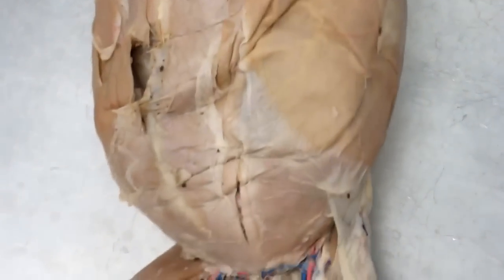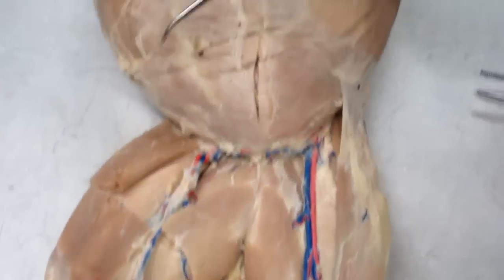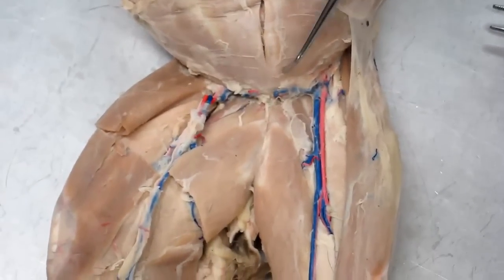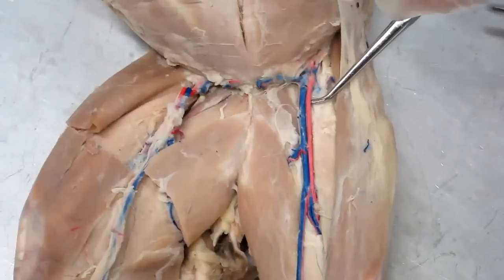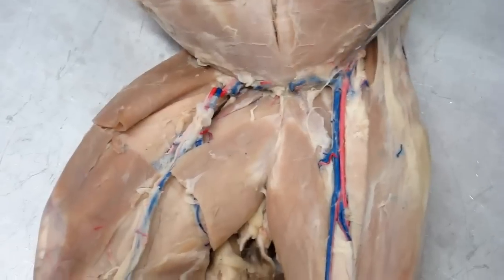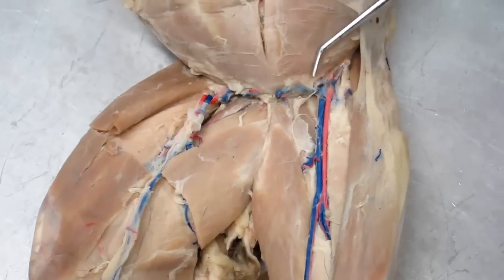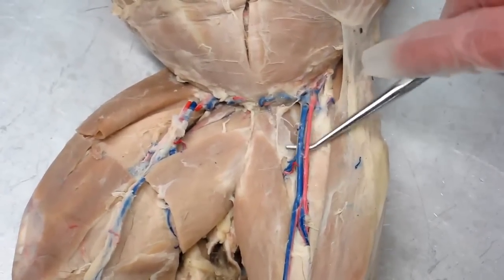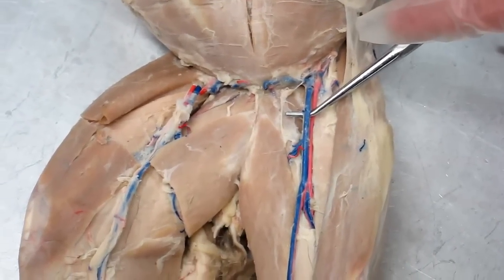Okay, as we head down to the leg, remember that the pelvic area is going to be on the model, so we'll take a look at that in a moment. We'll only be looking at the vessels outside of the pelvic cavity on the cat. Okay, so our inguinal ligament is our landmark here. Once we pass the inguinal ligament, we're out of the pelvic cavity and into the leg. That would allow us to call these vessels the femoral artery and vein.